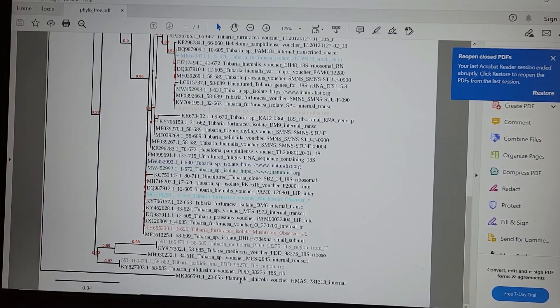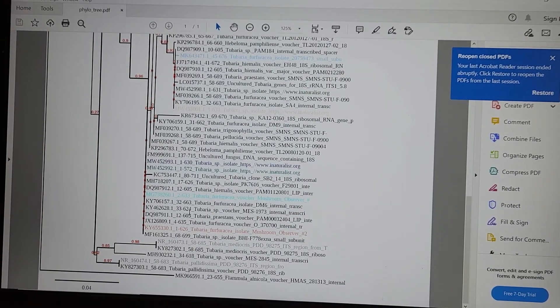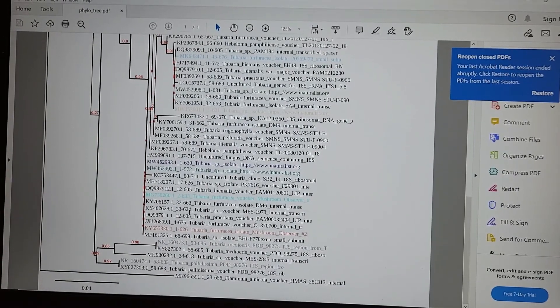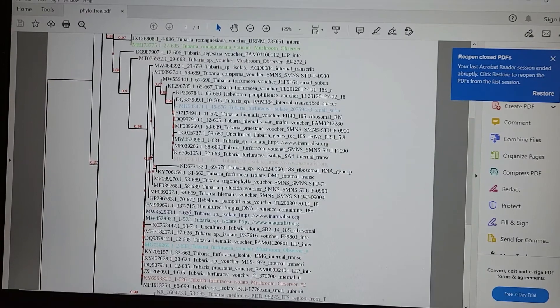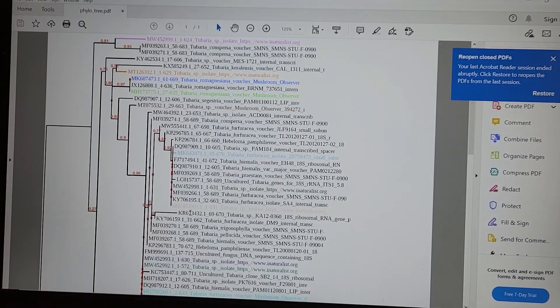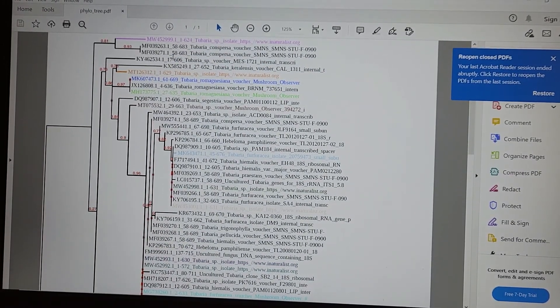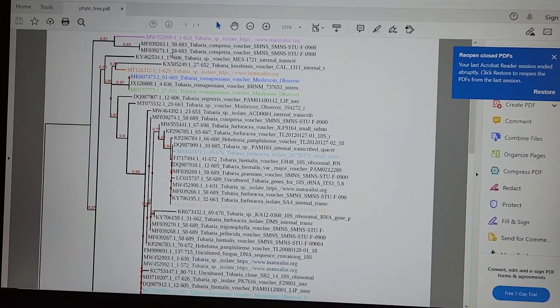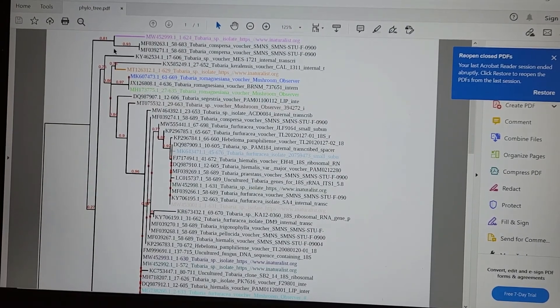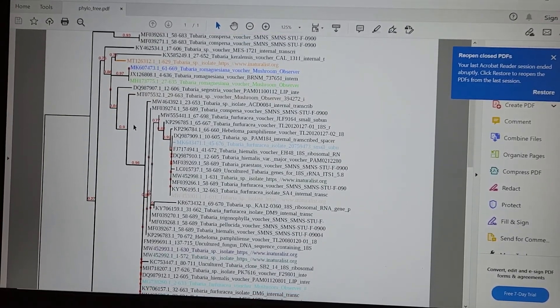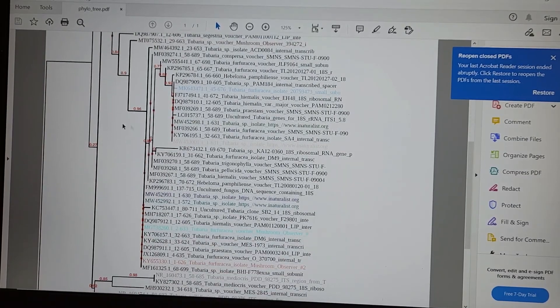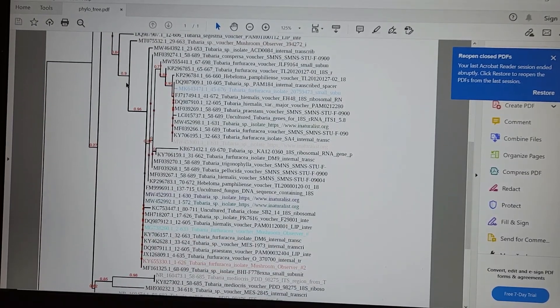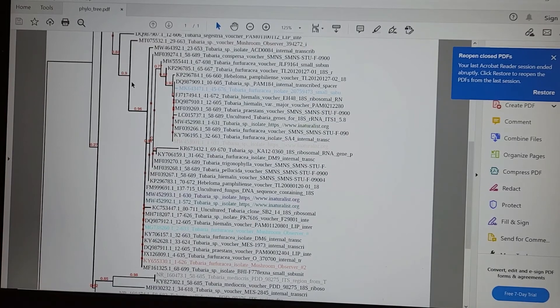And I set the out group as Flammula alnicola, something completely unrelated. And then put all the tubaria sequences that I could find into this program. And all the ones highlighted are ones that I sequenced, which have their own iNaturalist observations. And so I can see that the ones that I found separate out into a bunch of different trees, a bunch of different groups. Some of them don't have great support levels.